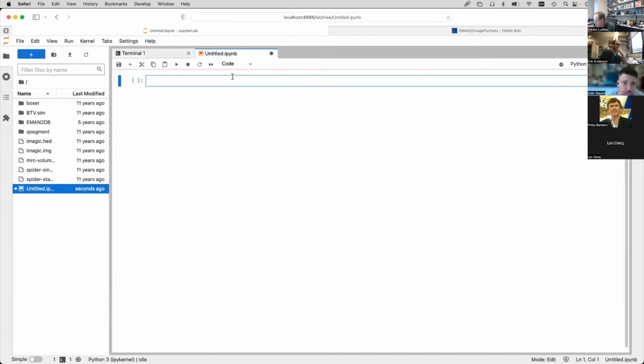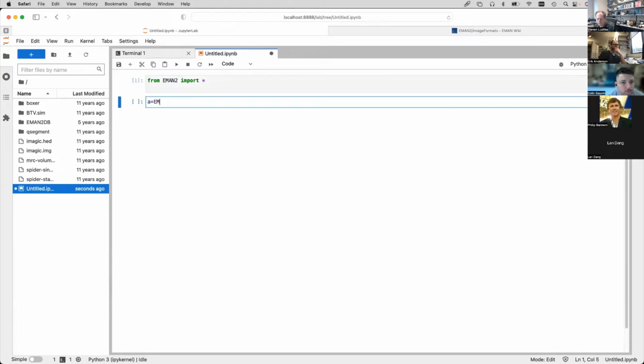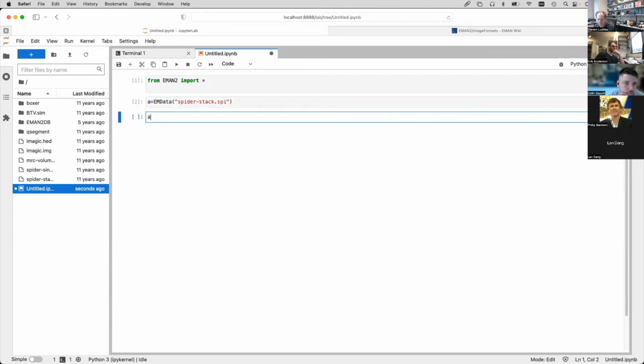So let's try this. So spider stack, if I do that, I will just get the first image in the file.